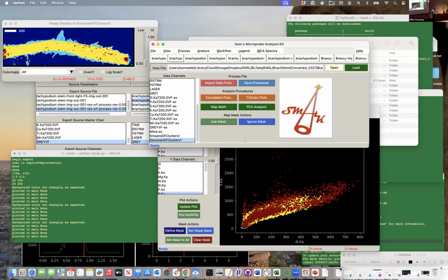Typically, if you export a layer or an image and you want the scale bar, it's doing a screen resolution capture, really, when it comes down to it. Or you can save it as a high-res TIFF, which is as pixels. I always get people who complain to me, I saved it as a high-res TIFF, but it's this big. It's because that's the number of pixels in your image, like 200 by 200 pixels. It's going to be really tiny, and they put it on this giant monitor. So yeah, it's going to be small.